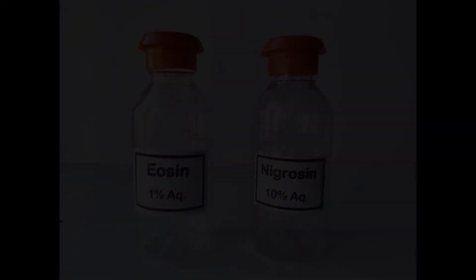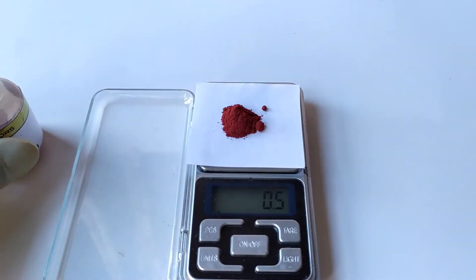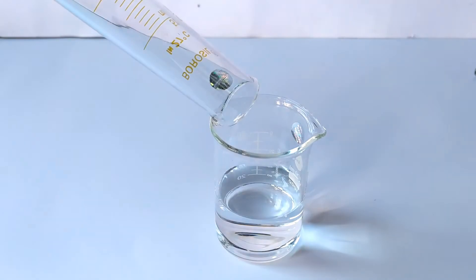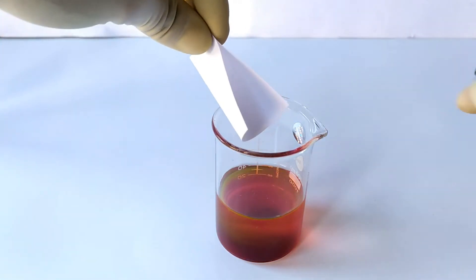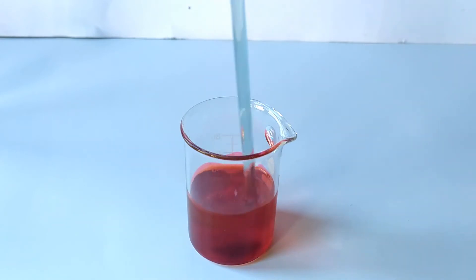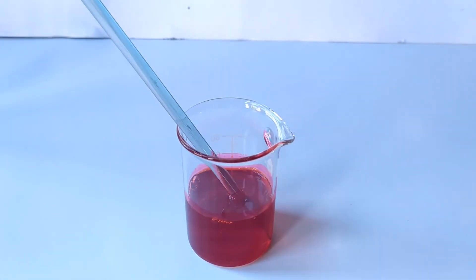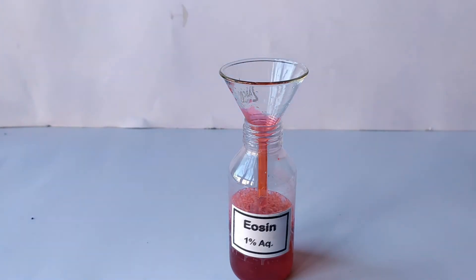To prepare 50 mils of 1% eosin, weigh 0.5 grams of water-soluble eosin powder using a weighing scale. Transfer it into a beaker containing 50 mils of distilled water. Stir to dissolve the stains completely. Transfer and store the solution in a clean, dry bottle containing an appropriate label.